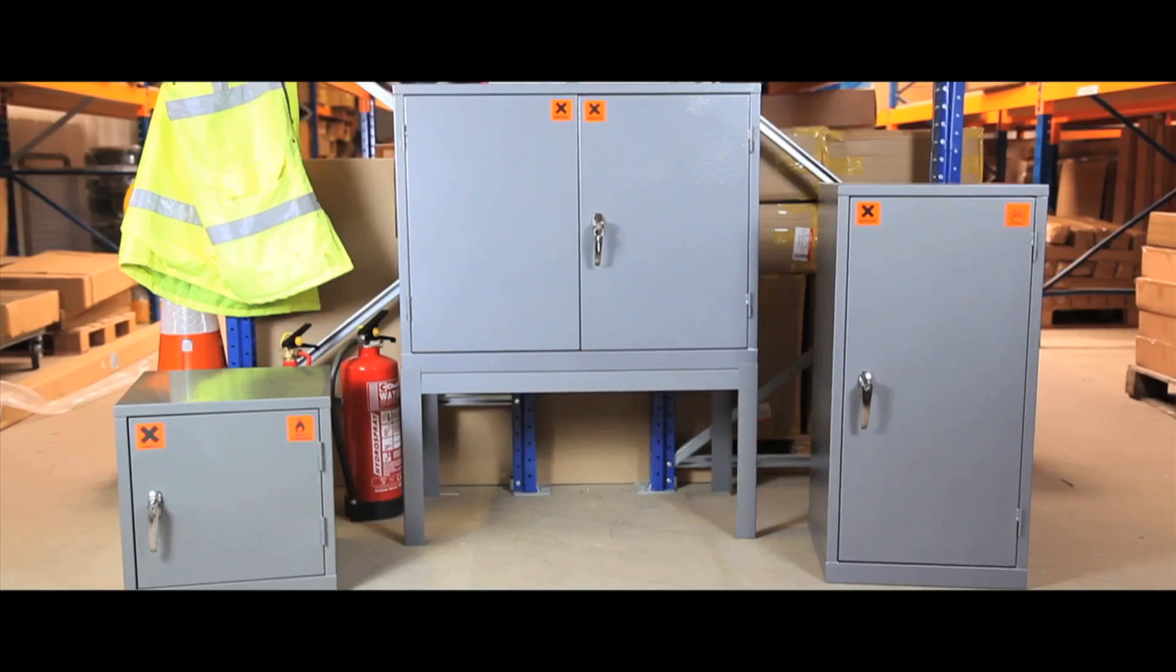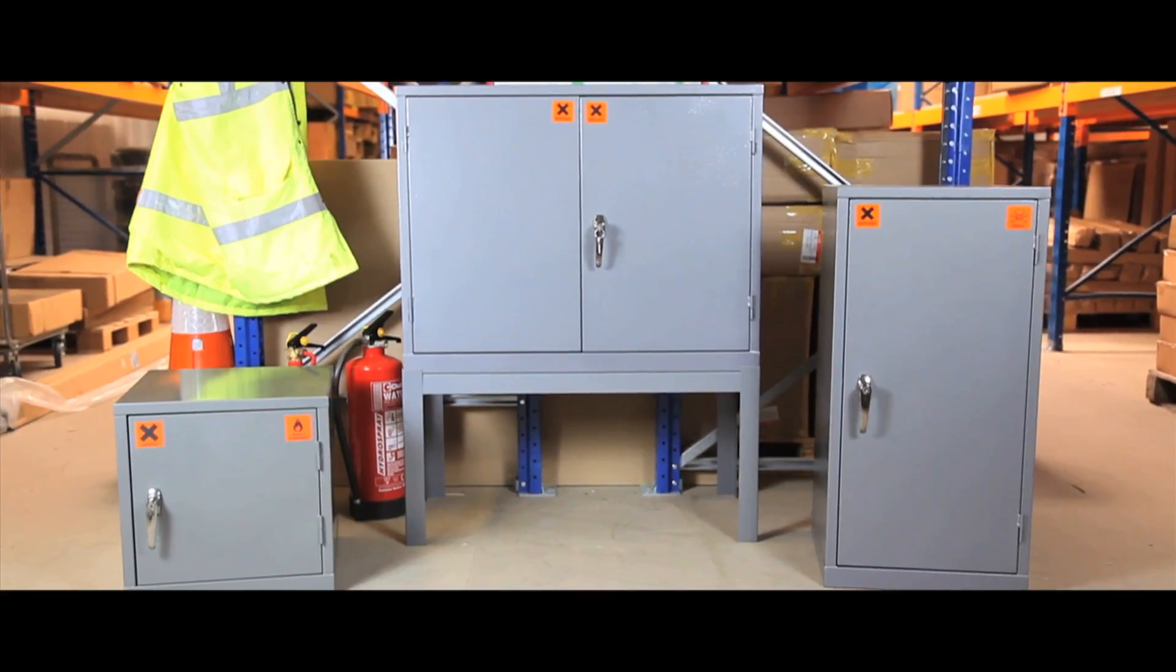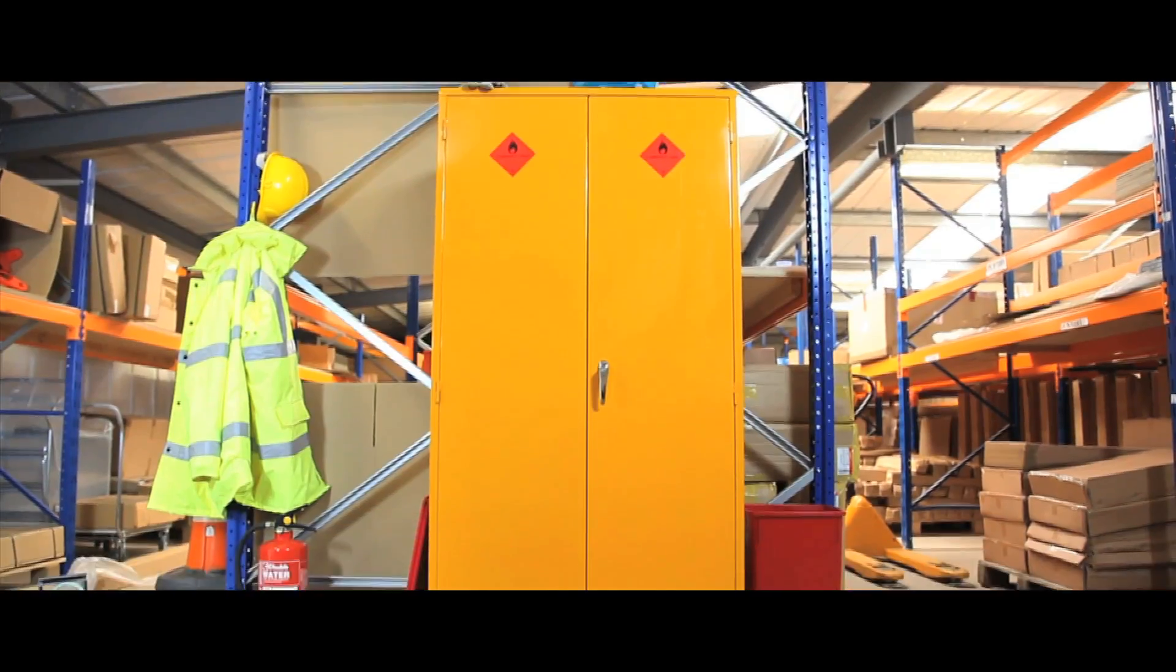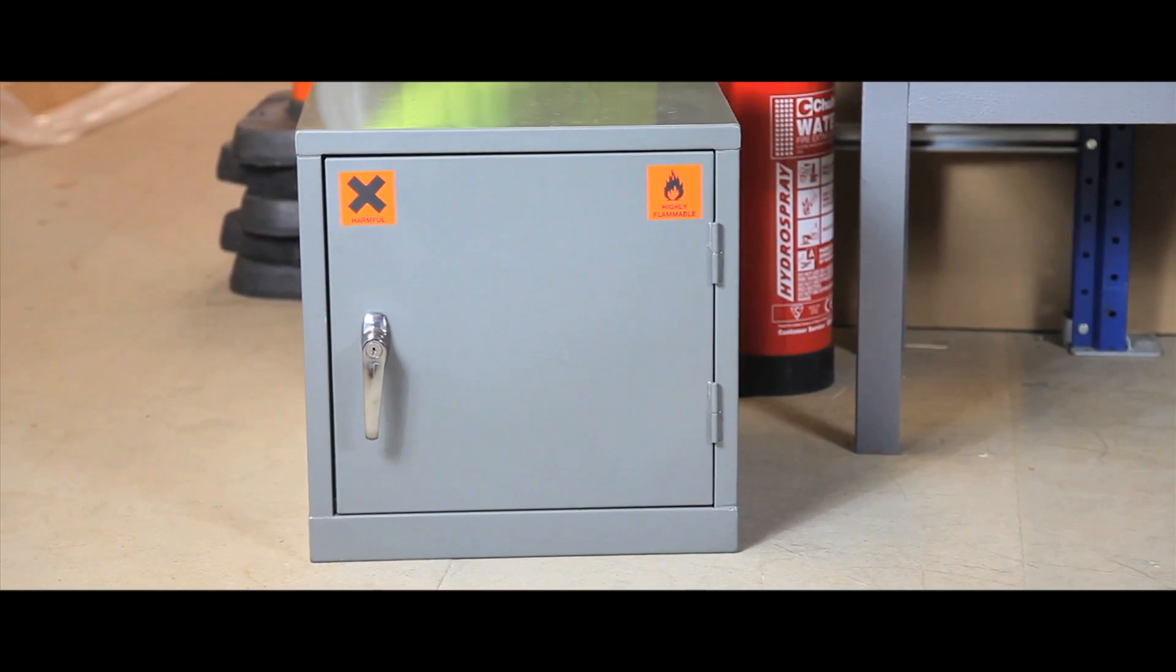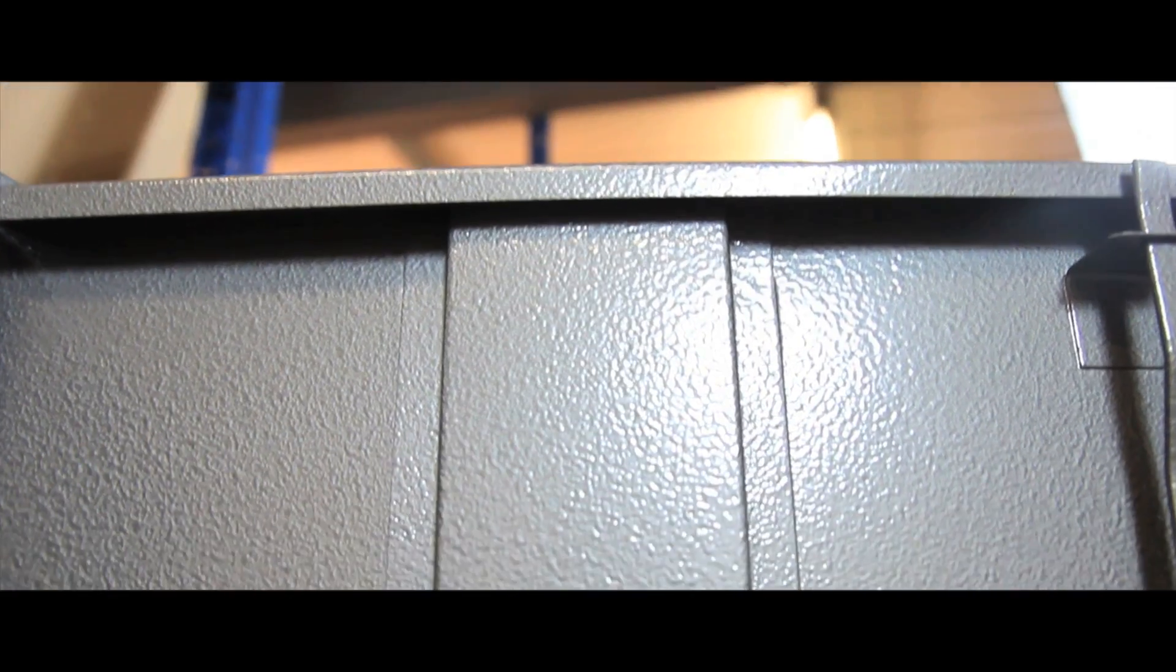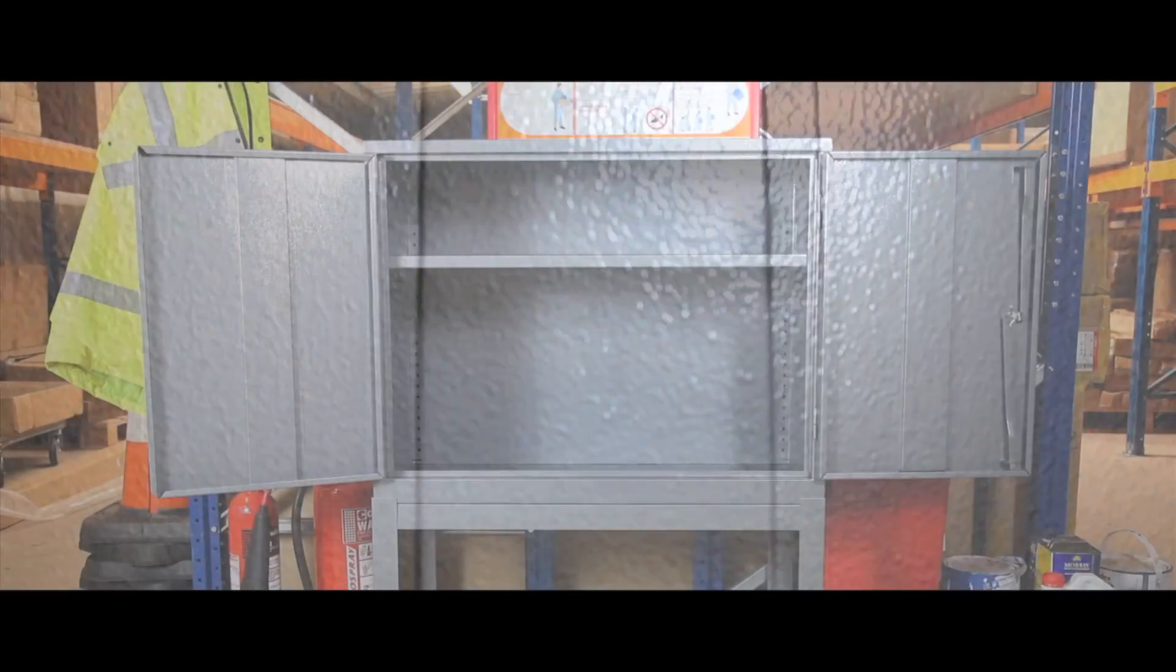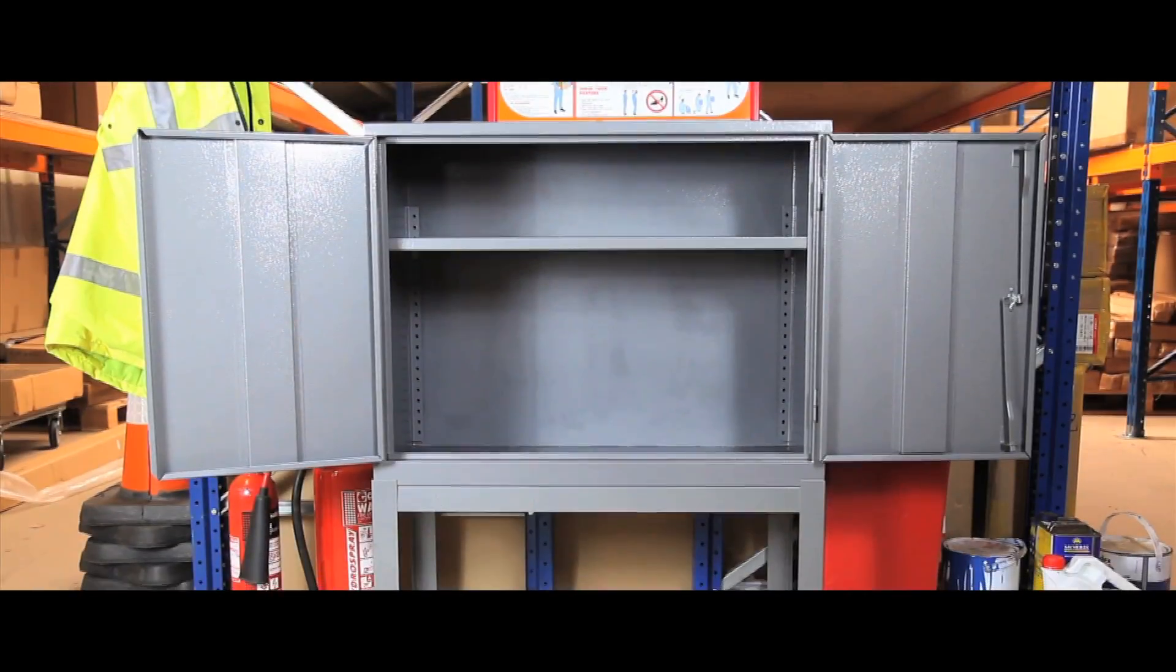Available in a wide range of sizes, colours and styles, most models support a 50mm sump depth, whilst the larger sizes have a 150mm sump depth. The units come with either one or two reinforced doors.